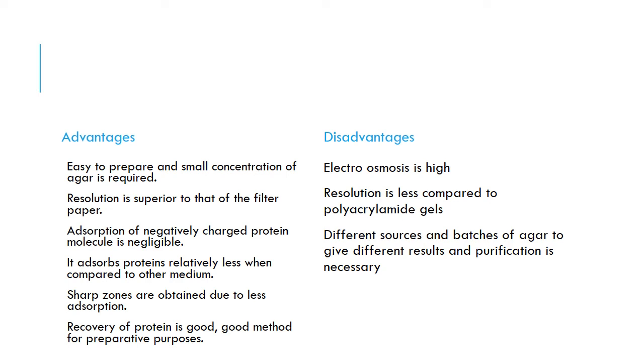So it has advantages. We also have disadvantages. On this side, electroosmosis is supposed to be high, and the resolution is less compared to what?